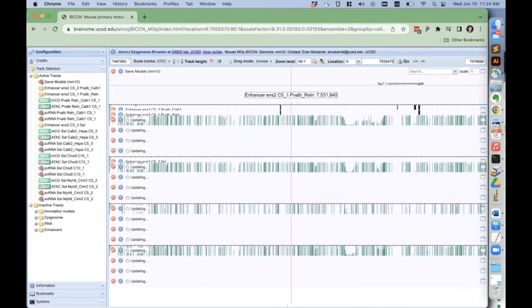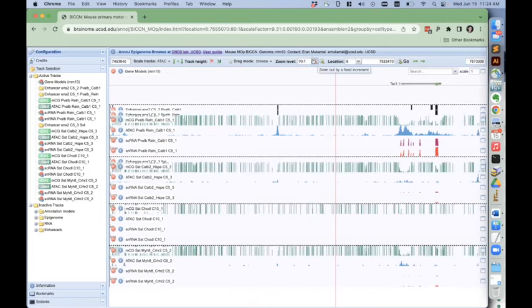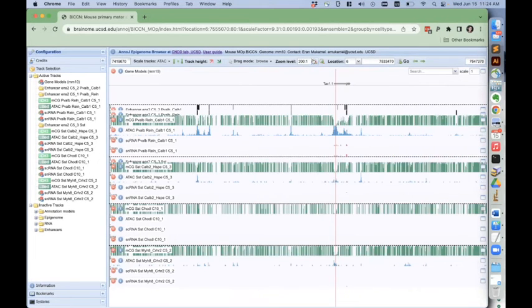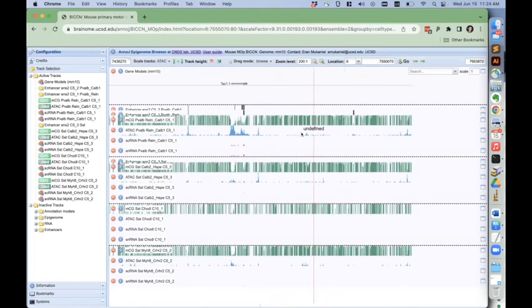We could zoom in on it, and this is important because this is really the value added of the epigenomic data. Obviously the RNA-seq is not giving us any information about this putative enhancer or regulatory region here, and these are the kinds of regions that we're often interested in for finding cell type specific regulation. And if we zoom out and look at other regions, we can see other potential regions throughout this 100 kb region around the gene that might also be potential regulatory elements.